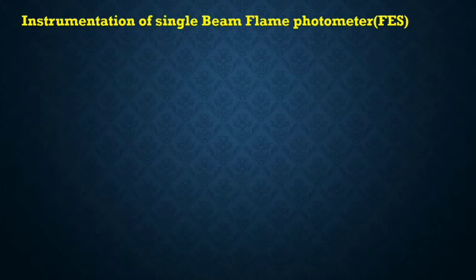Hello students, welcome. Today in this video lecture we are going to study flame emission spectroscopy, its instrumentation, construction and working, and various components of flame emission spectrophotometer. So let's start with instrumentation of single beam flame photometer.